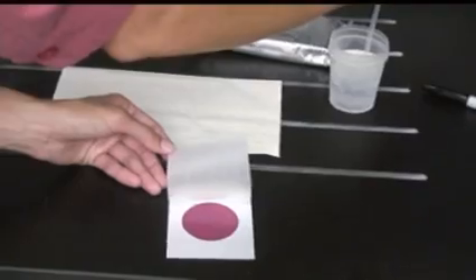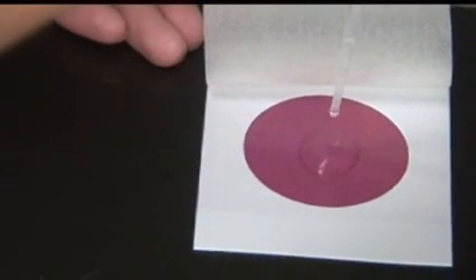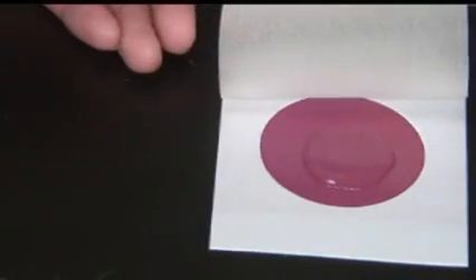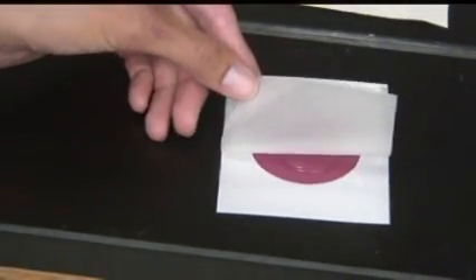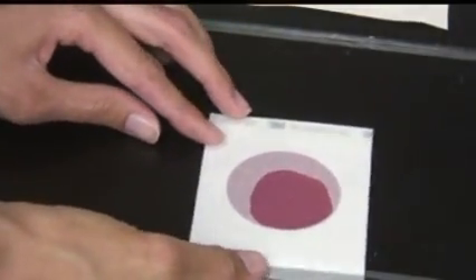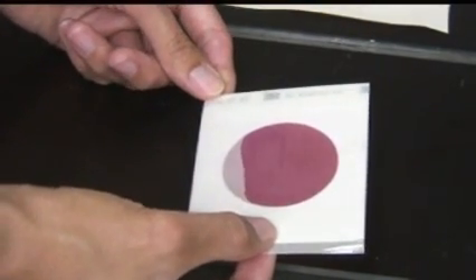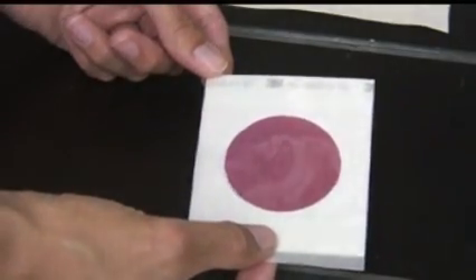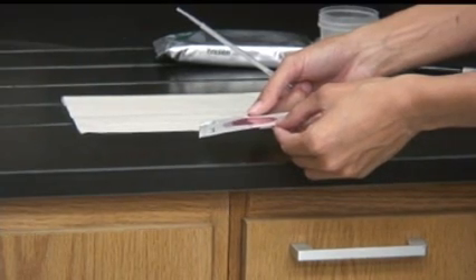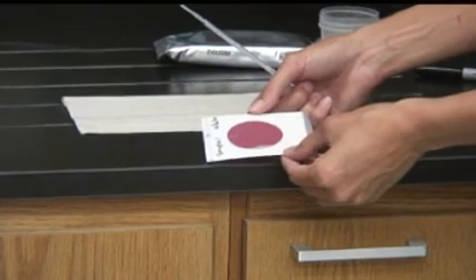Then, lift the top layer of the plate and gently squeeze out the sample onto the plate, being careful not to touch the tip of the pipette to the plate, as it's a very thin layer of agar and you can scratch it off. Then, gently roll the top layer back down on the plate, and if the water sample doesn't completely cover the area of the plate, you can gently rock it from side to side in order to more fully cover it with your sample solution.